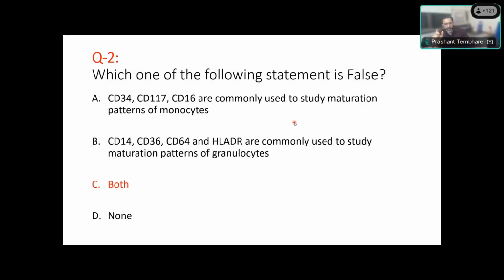For example, in acute leukemia with RUNX1-RUNX1T1, we know there is typical expression of CD56 and CD19 on leukemic blasts, or CD56 expression on granulocytes, which is aberrant.